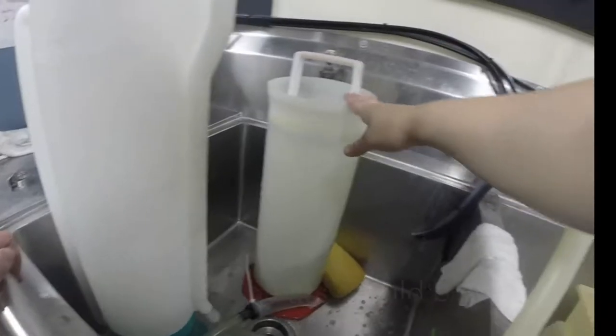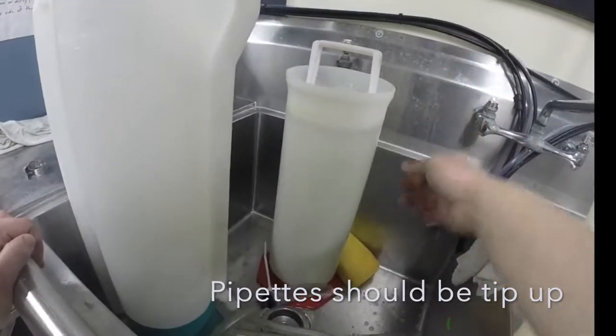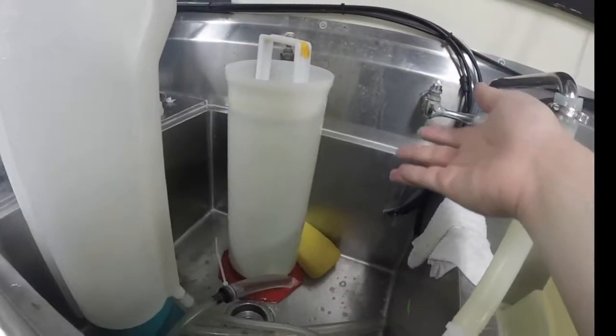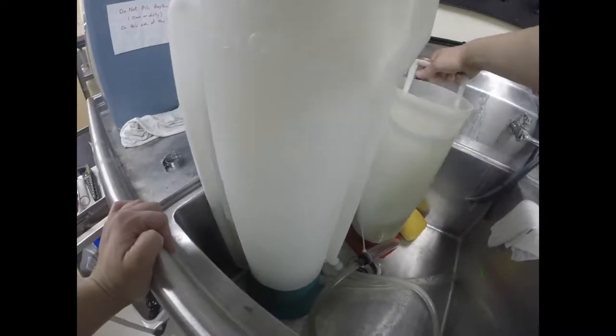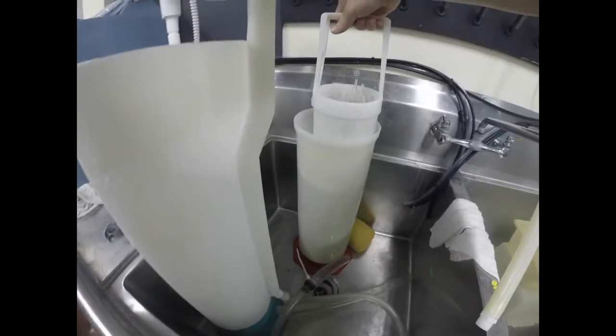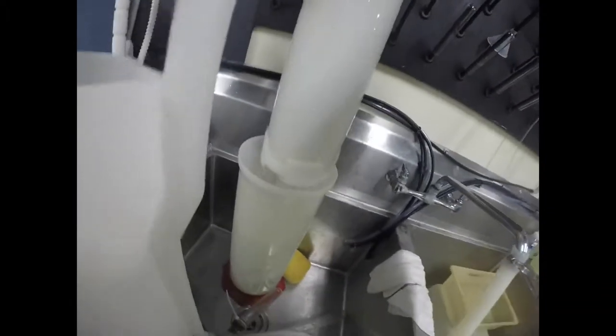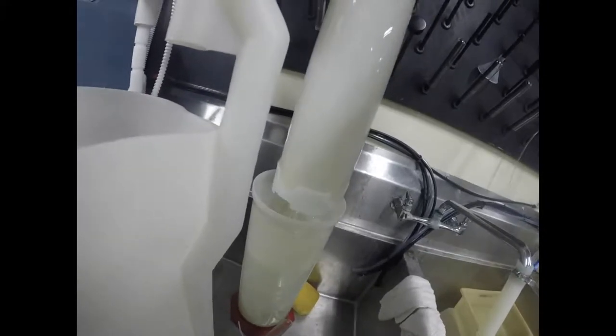This is where the dirty pipettes go. They go tip up in soapy warm water, and they soak in there for a little while. And this you kind of manually lift it up, and you can see the pipettes are full of water, they're draining. You can see the water coming out here, it drains in the soapy water.